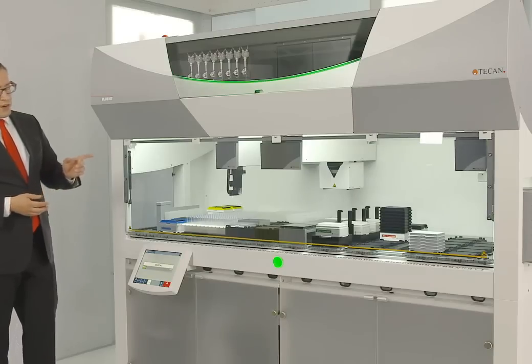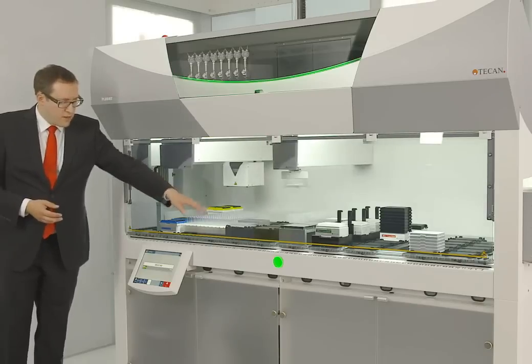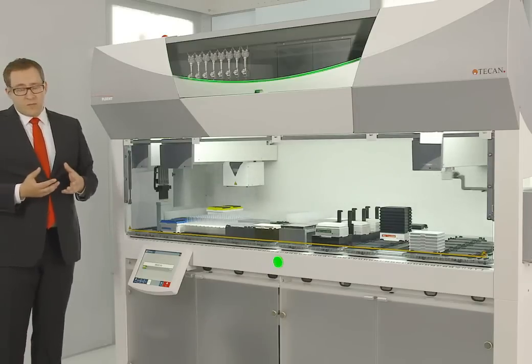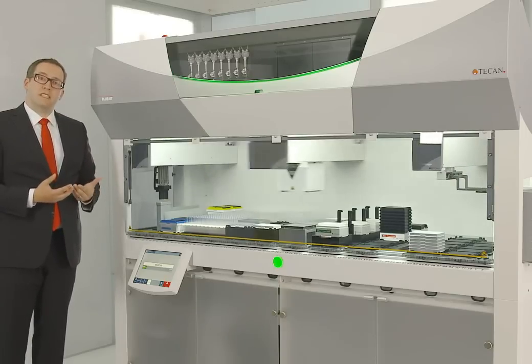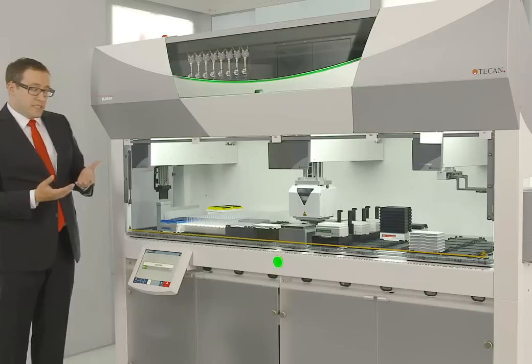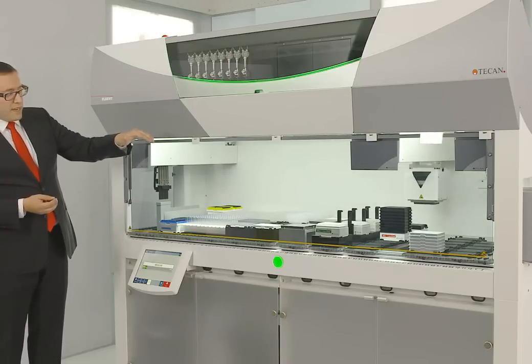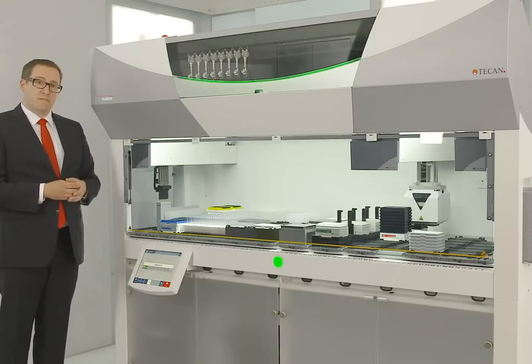The next thing we're going to show off here is the robotic gripper arm grabbing a plate out of the hotel, and we'll set it down here, again taking the lid off. We're preparing to show you some of the features of the multi-channel arm. The multi-channel arm is a 384 well arm that's actually capable of picking up different adapters that allow it to work with, say, 96 tips, or in the example we're doing here, we just picked up the 96 tip adapter, and we're about to go up and over this stack of tips to the back, and we're going to pick up only 4 rows of tips out of a 96 tip box.